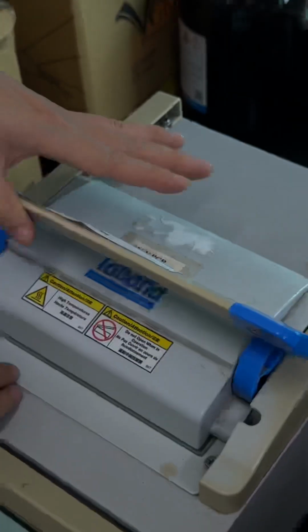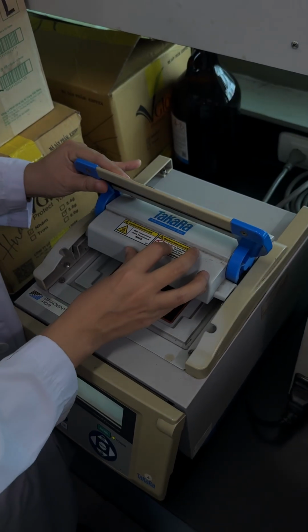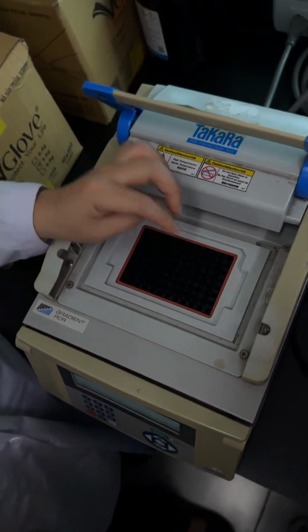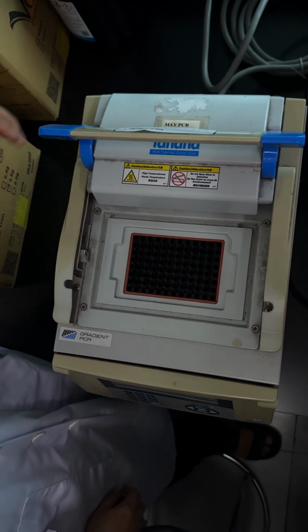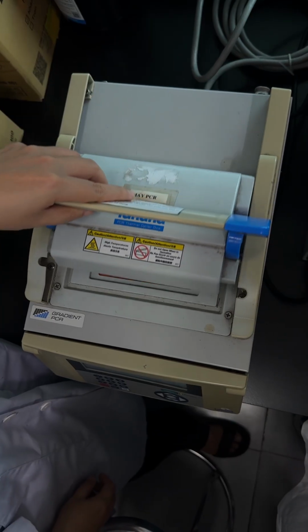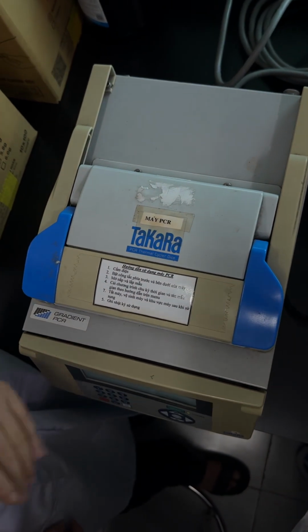Okay, but how do we load this? Oh, right. How you would load it? This is where you would load your PCR tubes. So you open it, load your sample, close it, and then set up and hit run.